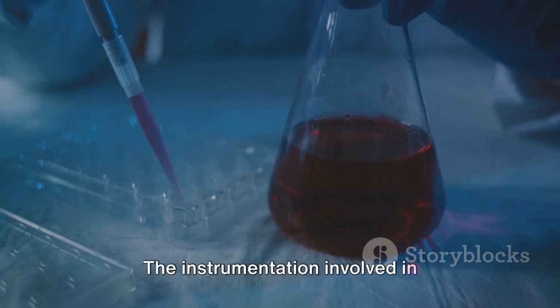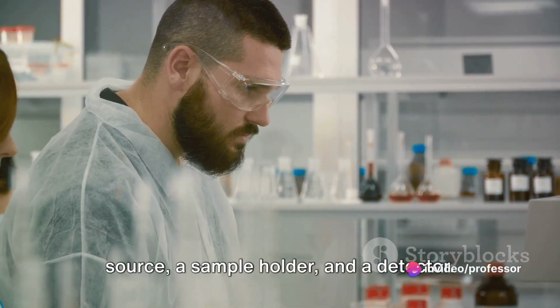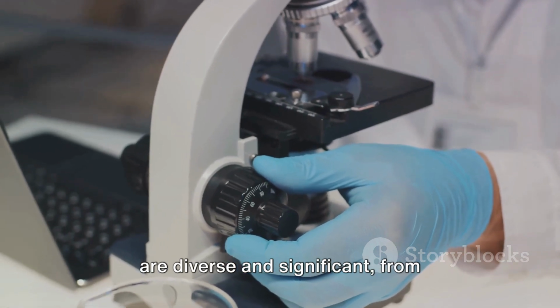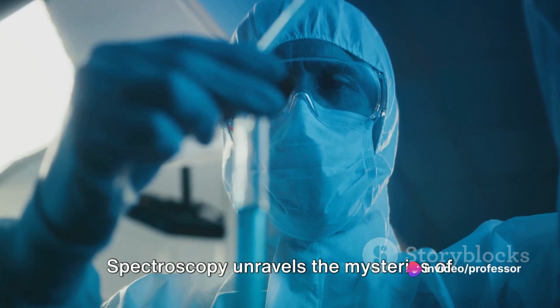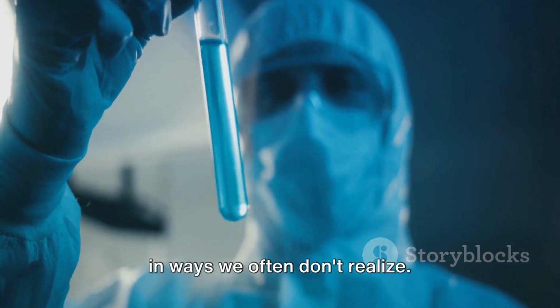The instrumentation involved in Nepheloturbidimetry is sophisticated yet elegantly simple, comprising a light source, a sample holder, and a detector. The applications of Nepheloturbidimetry are diverse and significant, from environmental monitoring to clinical diagnostics. Spectroscopy unravels the mysteries of the universe and improves our daily lives in ways we often don't realize.